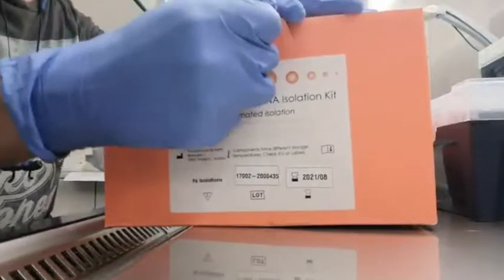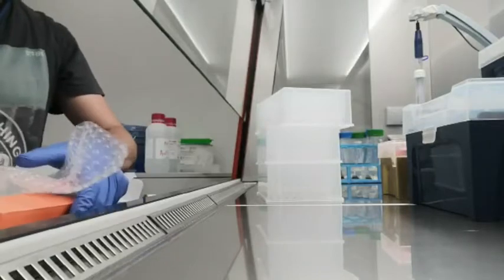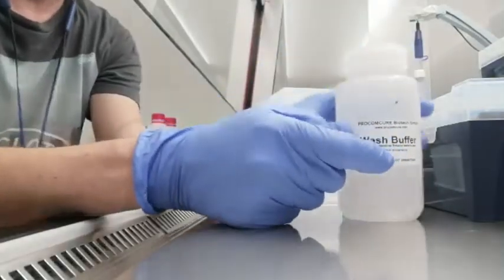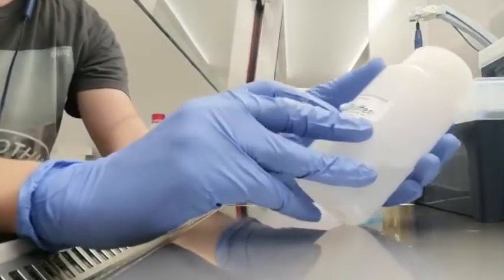Unpack the orange package. Remove the four bottles from the package. Prepare the wash buffer by adding ethanol to the concentrated wash buffer solution.